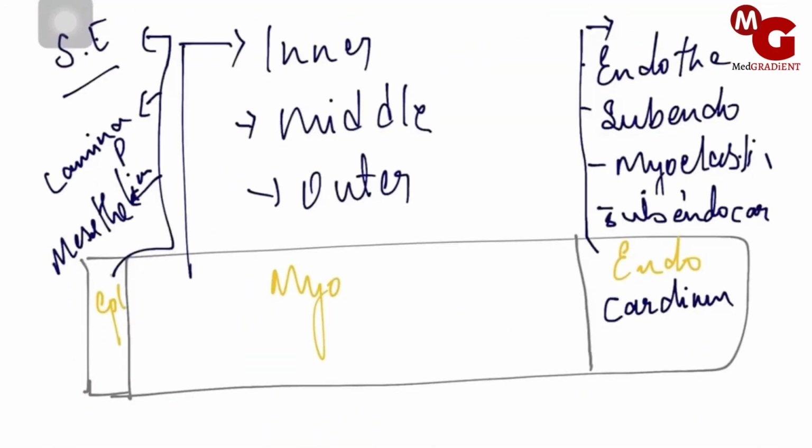Okay, let's go ahead. Now let's learn layer by layer the histology of the wall of the heart. We all know that the wall of the heart is mostly muscle, but we have to know that this layer of muscle, which is located over here, is just in between, and you've got a covering outside and inside, right?